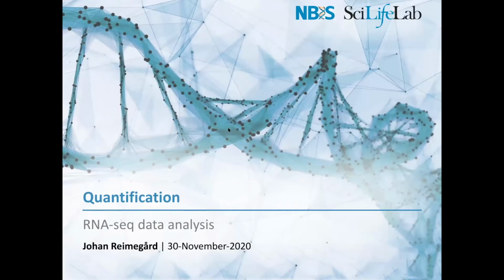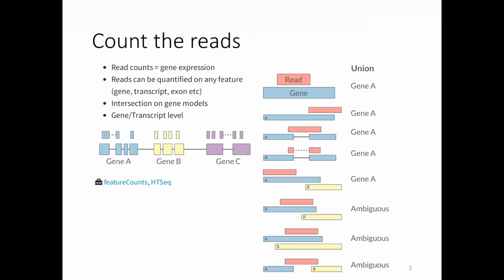Yeah, so this is basically the last step. So now you've made all the overview analysis, and now you want to go into the single reads, and you want to read the counts: where are they, in which genes are they actually ending up? Is it gene A, gene B, or gene C?